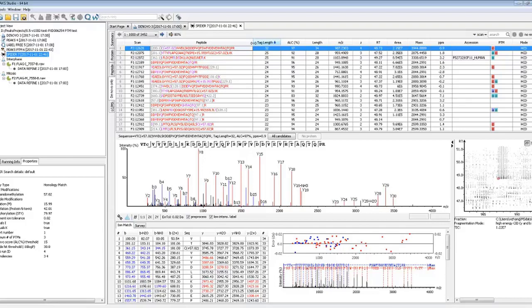The important thing here is that even though these were not matched by database search, you still have this Denovo only tab, which gives you a list of spectra which could be identified if you make some changes to your search parameters or try to identify them by different means. You could take out these Denovo results, put them into a blast search, anything that you could think of. The important thing here is that we still know which spectra we have that are not identified. So we have a starting point to make some good, true discoveries.